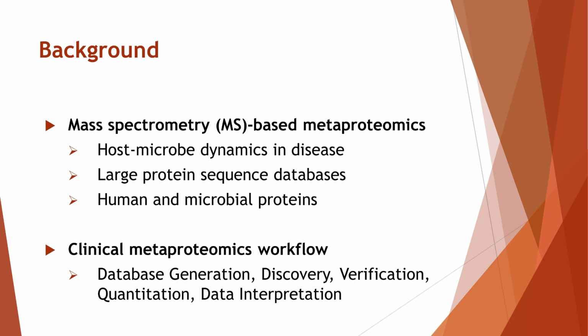To address these challenges, we have developed a novel clinical metaproteomics workflow that provides customized bioinformatic identification, verification, quantification, and taxonomic and functional annotation. This bioinformatic workflow is implemented in the Galaxy ecosystem and has been used to characterize diverse clinical sample types, such as nasopharyngeal swabs and bronchoalveolar lavage fluid. Here, we will demonstrate its effectiveness via the analysis of residual fluid from cervical swabs.